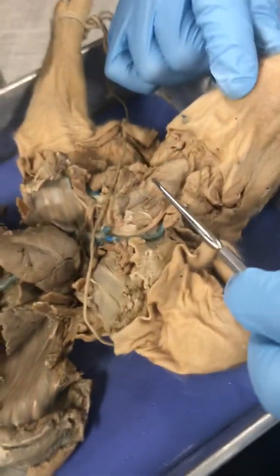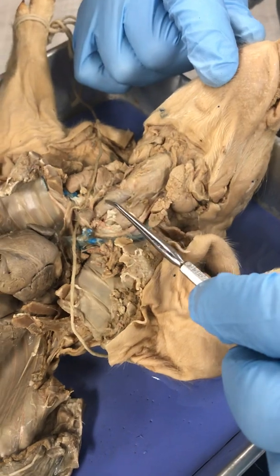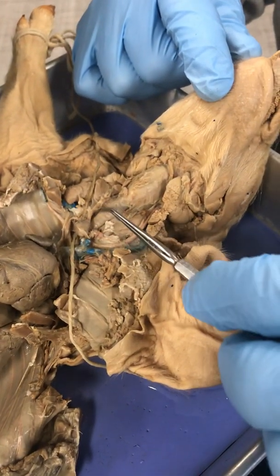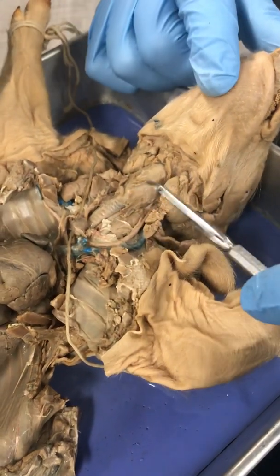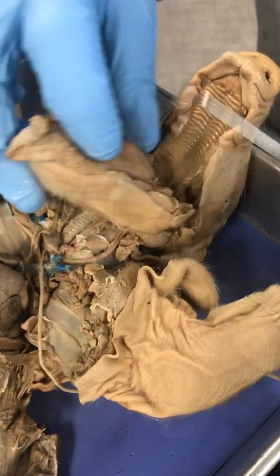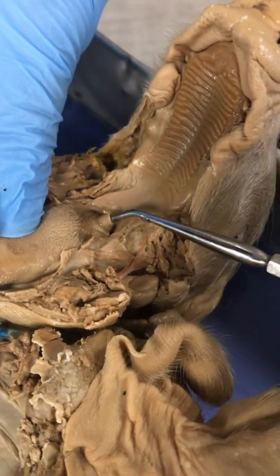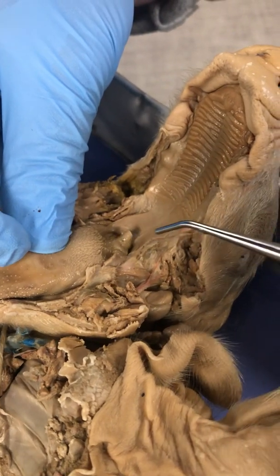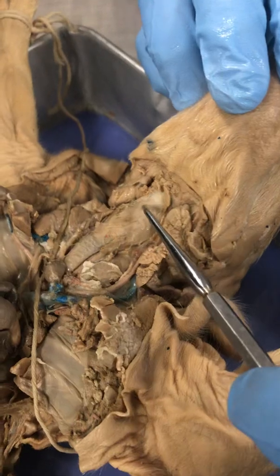Looking at here is the larynx. And then extending from the larynx, you can see the C-shaped rings of cartilage stacked one on top of each other. This is the trachea. And so sitting right on top of the larynx, if you go on the inside of the mouth and down far enough, you can see this little curled structure, and that would be the epiglottis. The epiglottis sits right on top of the larynx.